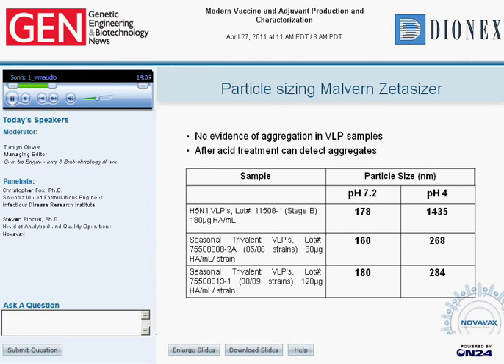Particle sizing using Malvern Zetasizer. In this technique, again, with just the VLP maintained at our normal pH of 7.2, we found for several preps that we had no evidence of aggregation. The particle size was always about 160 to 180 nanometers. However, if we dropped pH to acid conditions around pH 4, we now definitely could detect the presence of aggregates consistent with protein unfolding causing aggregation.